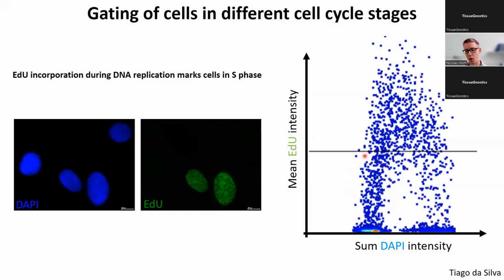They have a smaller amount of active replication forks within that half an hour and are incorporating less EdU on the left-hand side here. Cells that are sort of midway through replicating their genome will have incorporated more EdU within this half-an-hour window. There are more ongoing replication forks at the same time, so more EdU gets incorporated within that half an hour. And the DNA content starts shifting to the right because the cells are making new DNA, right? So that the DAPI intensity increases.